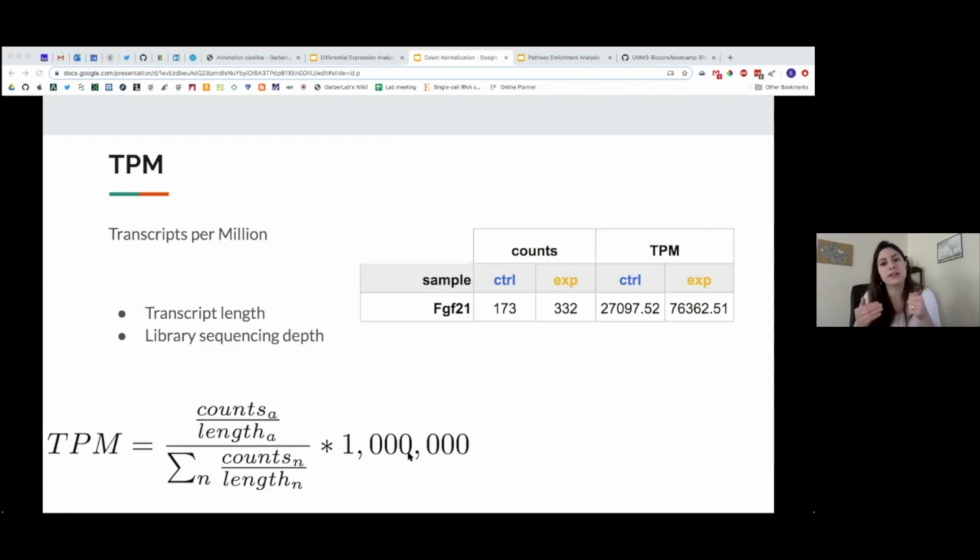So you're actually going to have multiple. It's more reads per million, not transcripts per million. Right. It would be reads in this case because we don't actually have a correspondence of 1-to-1. Remember, we were talking about this in the quantification session. So if you assume a 1-to-1 correspondence, then you're saying transcripts. And if you have unique molecular identifiers, you can actually have that as correct association of 1-per-1.